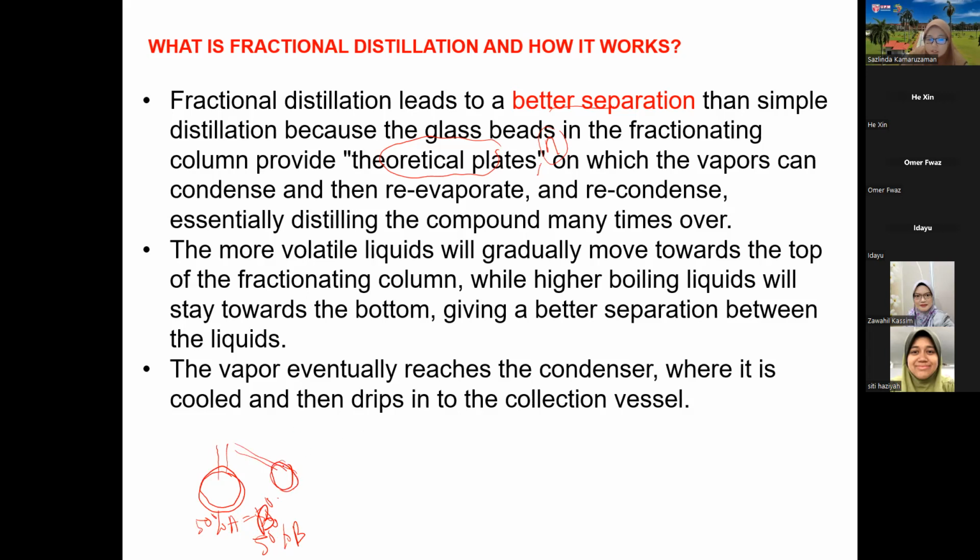Okay, so towards the end, you find out that 68% is substance A and another 32% is substance B. So you believe that the boiling point of substance A is much lower, so that's why it will be vaporized, right? Okay, so this is what we call a simple distillation, and it involves one cycle, which we call one theoretical plate, which is vaporization and also condensation. Okay, so of course, you can proceed with another simple distillation.